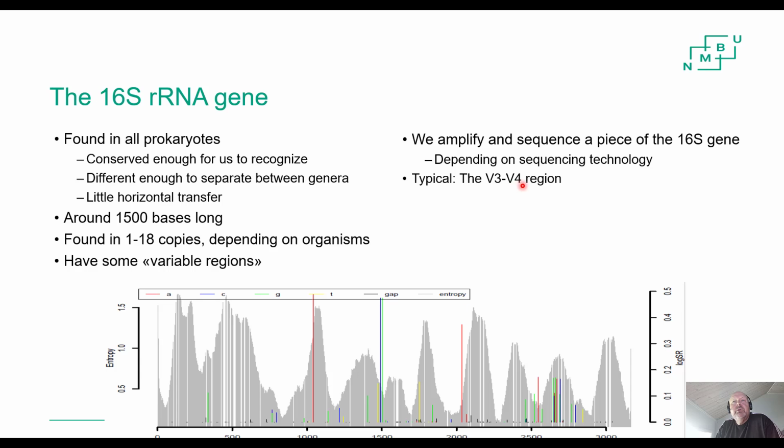The V3, V4 region is popular. You can see the two mountains. This is V3 and this is V4. They are really informative parts. Or out here, which is also popular.